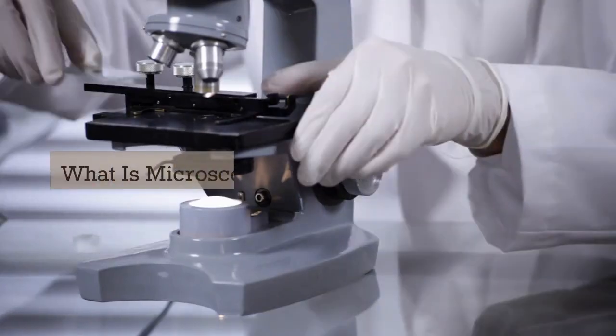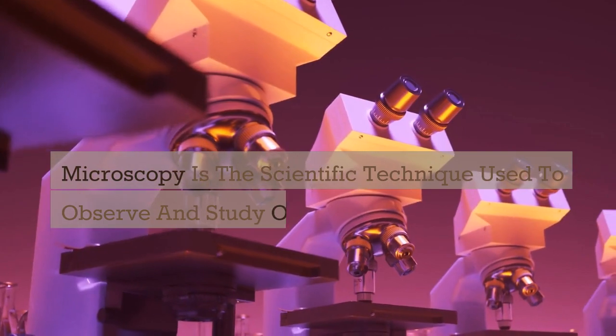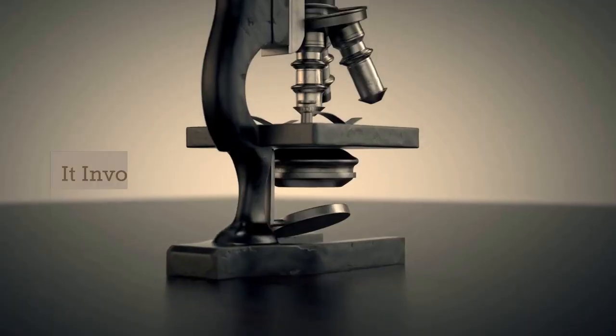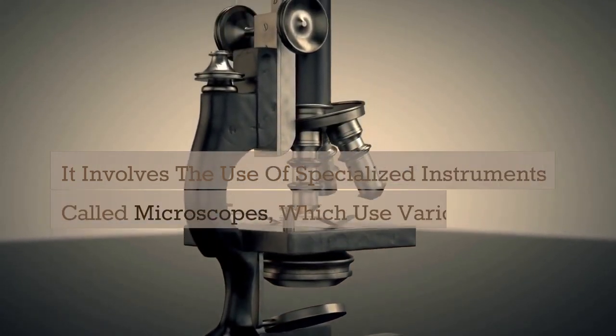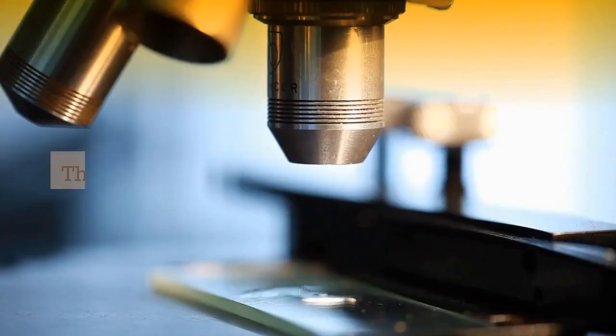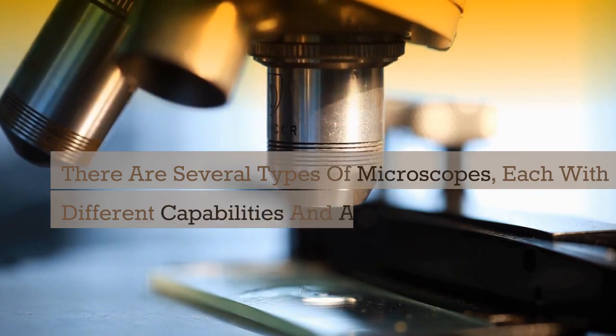What is microscopy? Microscopy is the scientific technique used to observe and study objects or samples that are too small to be seen with the naked eye. It involves the use of specialized instruments called microscopes, which use various types of lenses to magnify and resolve the details of a sample. There are several types of microscopes, each with different capabilities and applications.